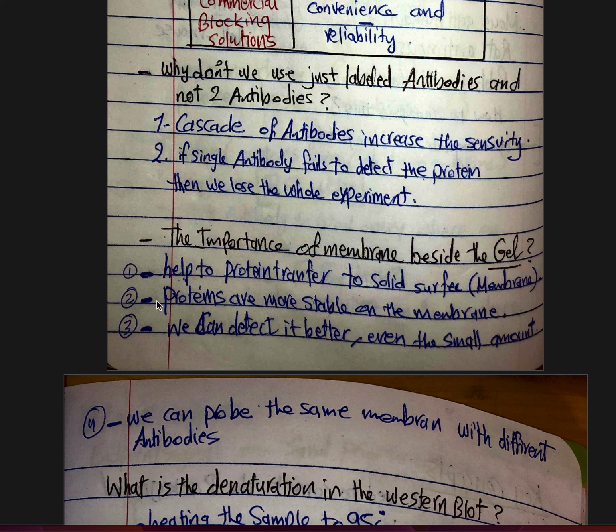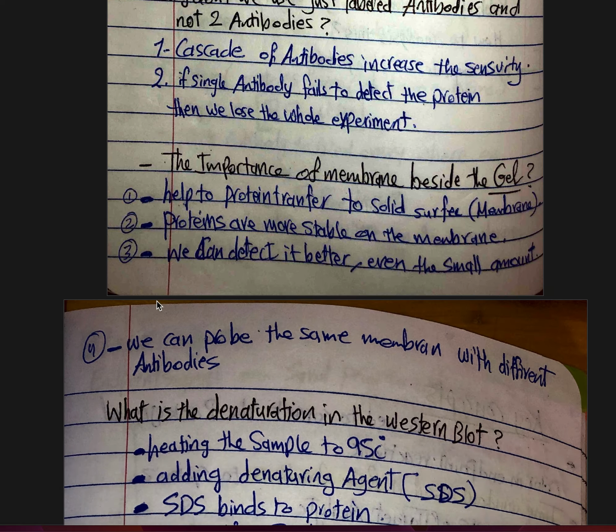So I think all of these questions are repetitive, but I think these two questions are important. Why can't we use just one antibody instead of two? Because the cascade of antibodies increases the sensitivity, and if a single antibody didn't detect the protein, then we would have lost the whole experiment. That's important. And also why we use the membrane beside the gel: because the proteins need to be transferred to the solid surface, and the protein is more stable on this membrane, and also the membrane can detect even a small amount of these proteins.